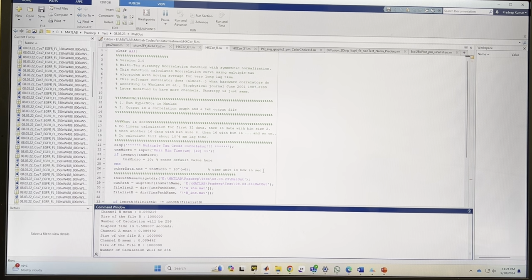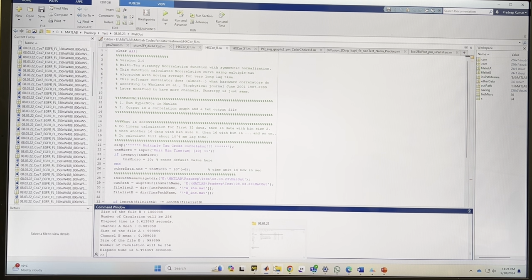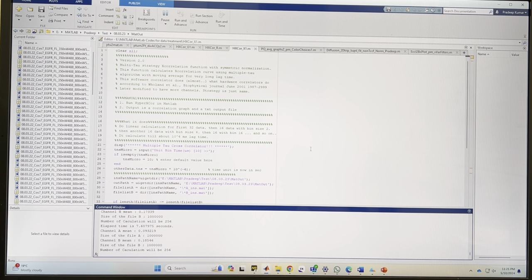It's taking some time. Usually a full reading takes around 2 to 3 minutes. Yeah, it's done. So you can see, I can see all here. Oh, it's still this one. Since I started Z first, it may take a couple of seconds, I guess, because we have to let all three finish completely. Yeah, it's done. Once it's done, I can close the two windows.